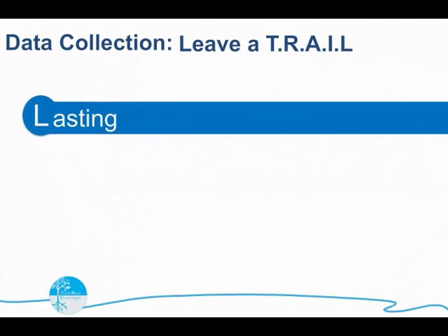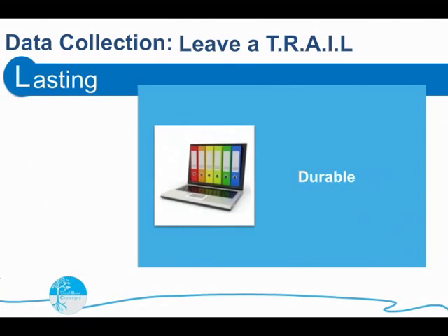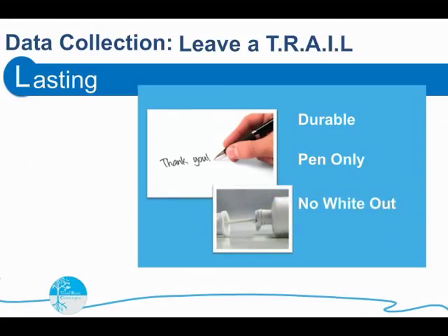And after all the effort it takes to run an experiment and record the data, it's important to make sure that the data lasts. Use pens, not pencils. And mistakes happen, but covering it up is wrong. Don't use whiteout.